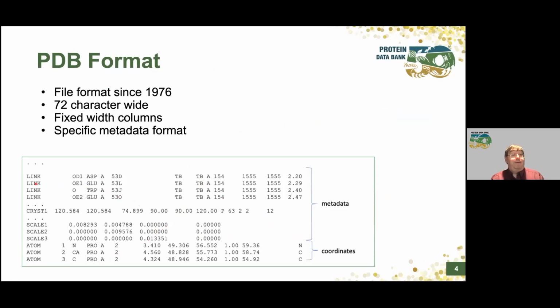And I just want to point out a few features of it. I'll go down to the atomic coordinates section down here first. This is the part which many people use. We have a series of atom names associated with a residue, with an XYZ coordinate, a sequence number, occupancy, and temperature factor.